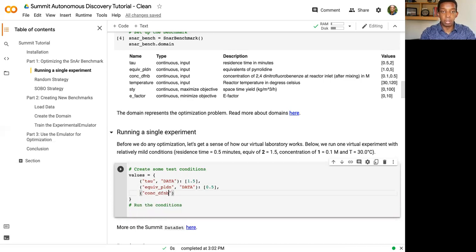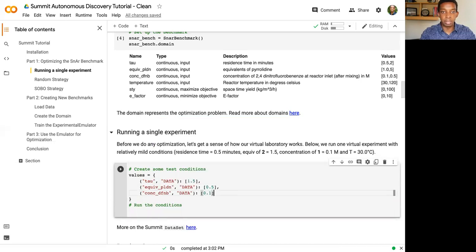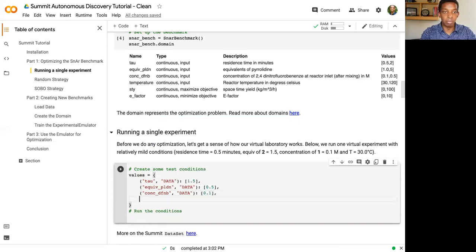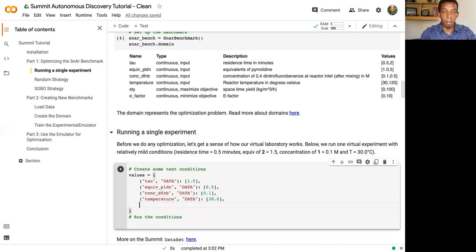And you'll also see that I'm typing an extra parameter in this tuple for each column or each variable. That is to say that the column is a data column versus what we call a metadata column. So there's an extra feature in data sets on top of regular pandas data frames that allows you to specify certain columns as metadata columns. So I'll do that right now.